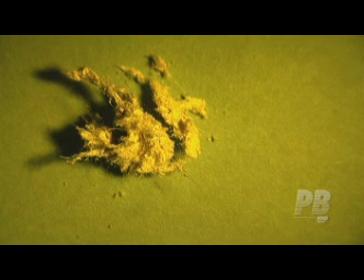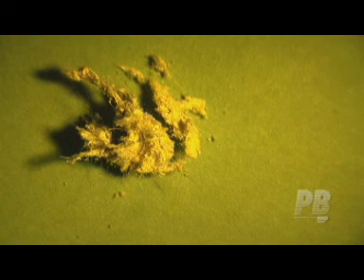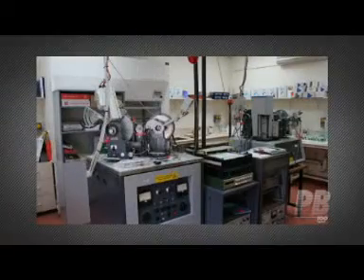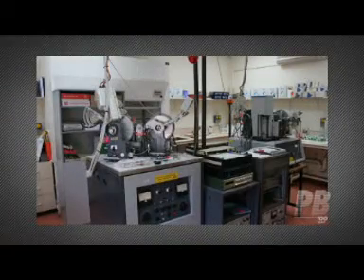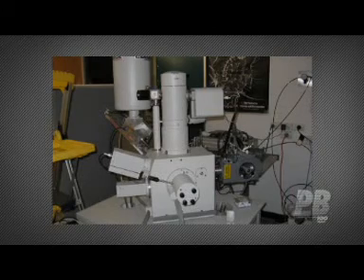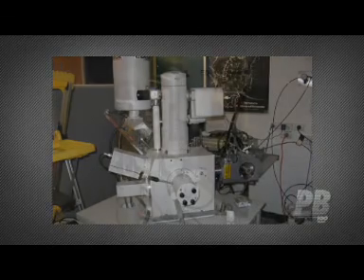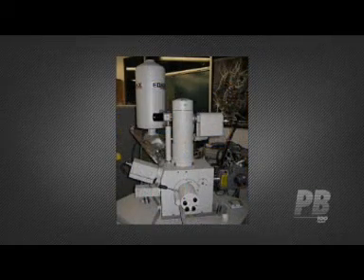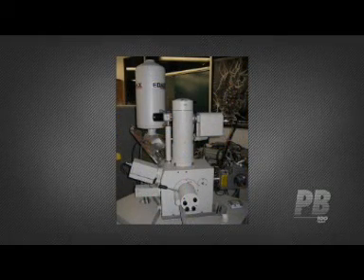Alternately, the fibre may be one of the non-commercial asbestos fibre types not commonly found in building products which the laboratory does not have NATA accreditation to identify. The fibre should be treated as an asbestos fibre until analysis by another technique, for example, X-ray diffraction or scanning electron microscopy, confirms the type of fibre.